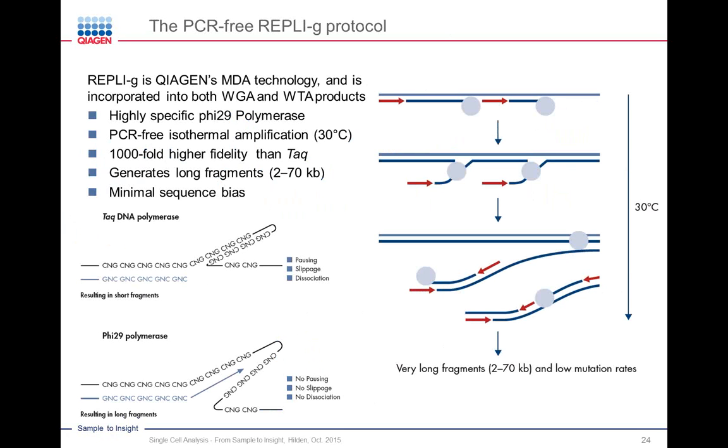So I'll take the third part of this seminar and take, I guess, 10 minutes to talk a little bit about our MDA technology and why this is so important for a single cell workflow. This first step, where you're essentially copying the DNA out of a single cell, is used for whatever downstream process, and also to bank as a sort of biobank.